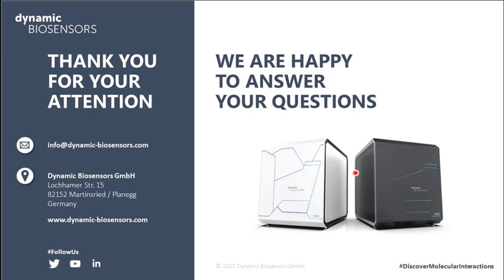Thank you. So could target or oligo conjugation block the binding site, and how would we deal with that? That's typically a question that we do get as well: is there a possibility that the conjugation itself may impact the affinity of the antigen to the antibody? One approach that we recommend for all users of our device, especially when it's the first time they run their assay, is to invert the assay orientation. First work with the ligand on the surface, and then work with the antibody on the surface and see if the kinetics or the binding affinity is comparable. If it is, that is an empirical indication that we haven't blocked the binding site by running the conjugation. If there is a significant disparity, then further analysis is needed to confirm whether or not this is the case.